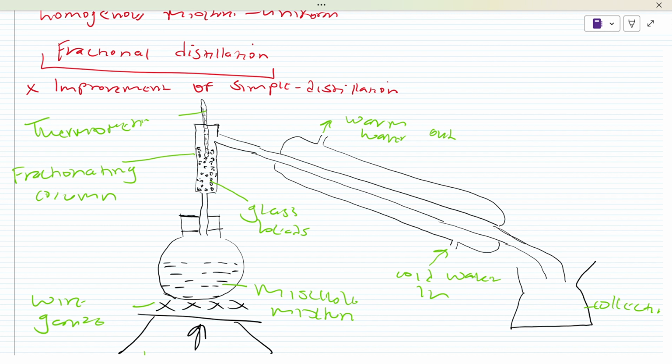So after knowing those key things, it will be easy for you to do an analysis. And remember, we use fractional distillation to separate mixtures that consist of components that have different boiling points. I'm going to say that again. They have different boiling points. Meaning if there are two or more substances, the key thing about those substances, their property of boiling point, still differs, even in the mixture state that they are in.